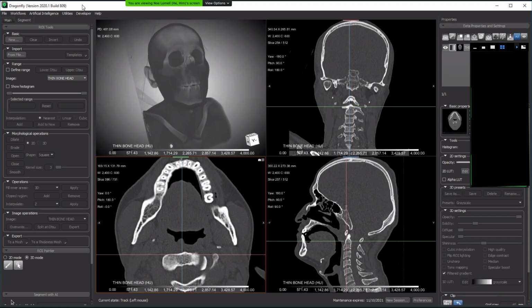Okay. Yeah. The Segmentation Wizard did have some changes from 2020.1 to 2020.2. So you are not able to reproduce everything I do today with the 2020.1 version. Okay, I can download it now if that's okay.